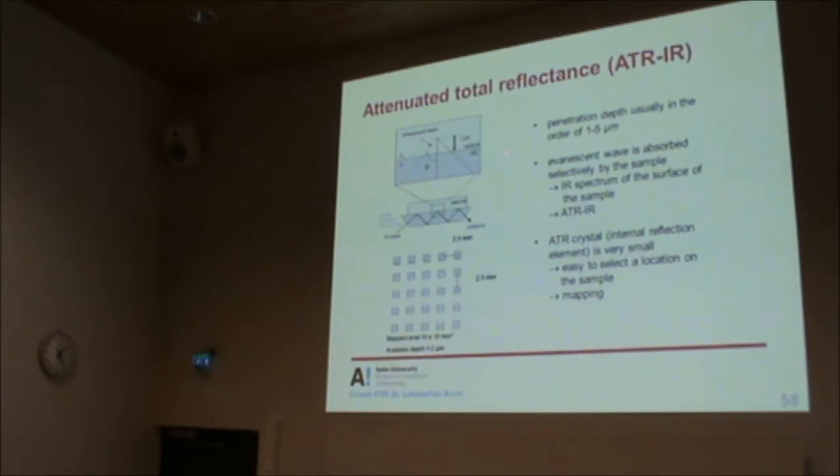In an actual ATR setup, what is presented is squares of places where the total internal reflection happens. You put the sample over this place, and the sample, let's say you take paper, the paper you guys are writing on, powder it, make a fiber mesh out of it. You can put the fiber on this, and the fibers will make contact on these squares at random points, and so those fibers will constitute this region. You understand this? What is your sample going to be? Your sample is going to be in this region.